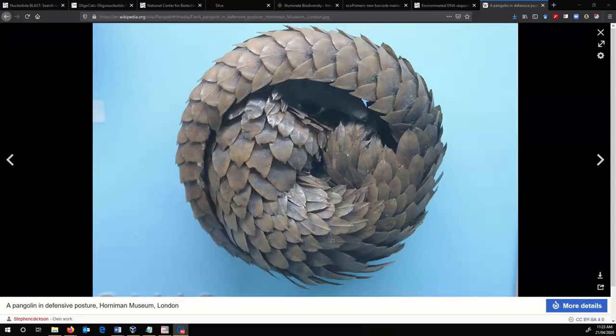Hi everyone. So it's Tuesday, the 21st of April, and I promised that I would give you a tutorial today on primer design for DNA metabarcoding. And I'm going to start out by saying that there is no one way to do this. This is probably the most frustrating thing for you to hear about the whole process, but there are hundreds of different ways to do it.